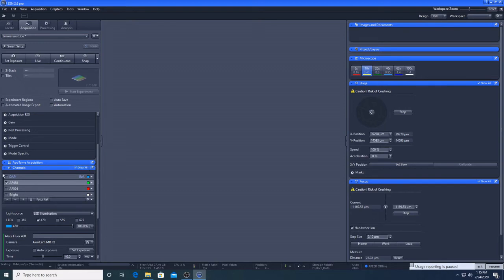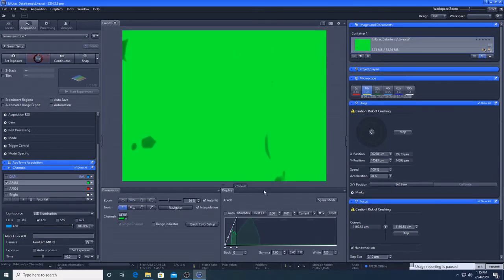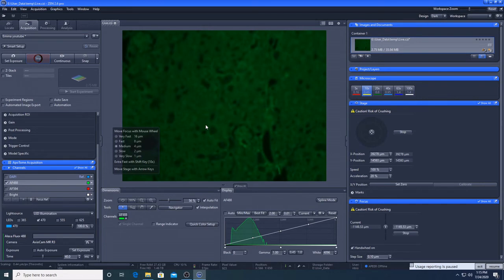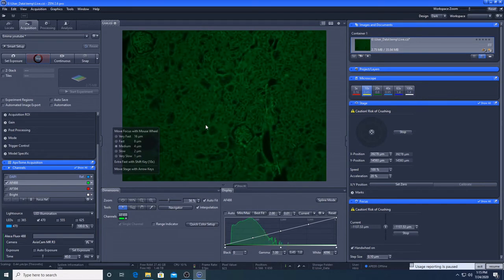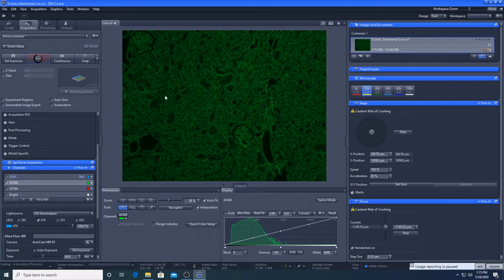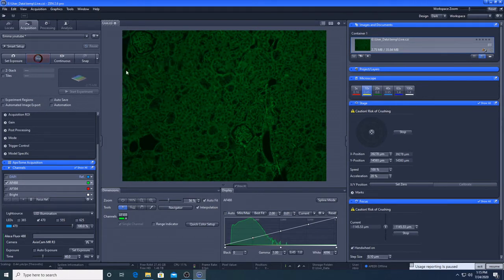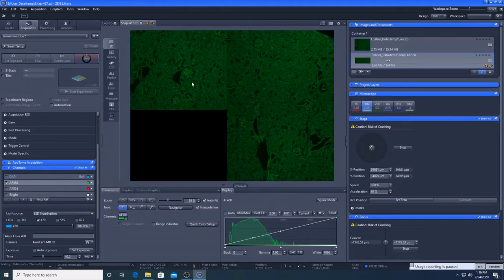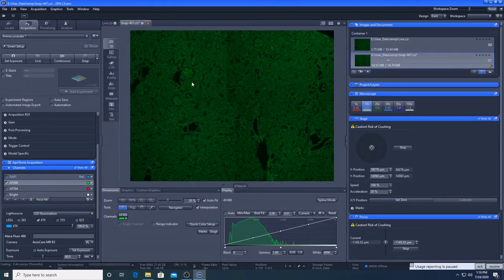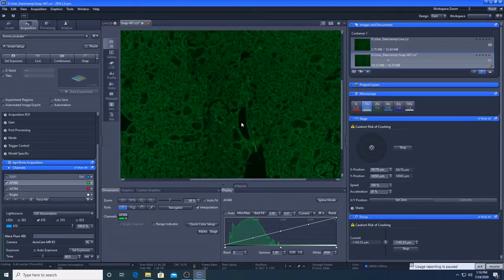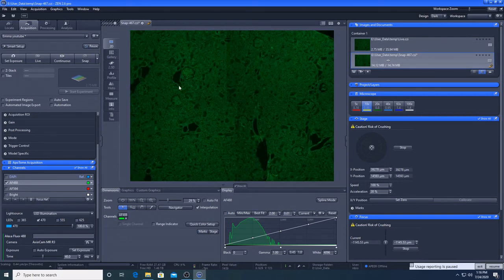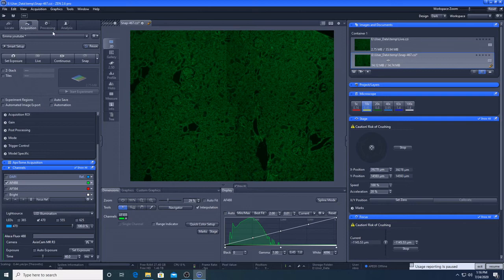So if I go live, I'm still on the 10x, I'm going to get it in focus. There we go. So if I wanted to do a very simple tile, I can use this drop down menu here, if I go two by two. So you can see it's taking four images. If I zoom in, you can see the joins here.